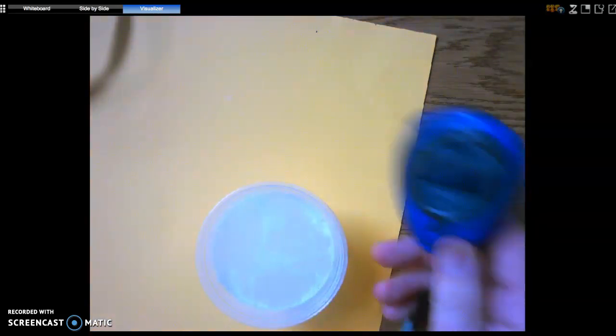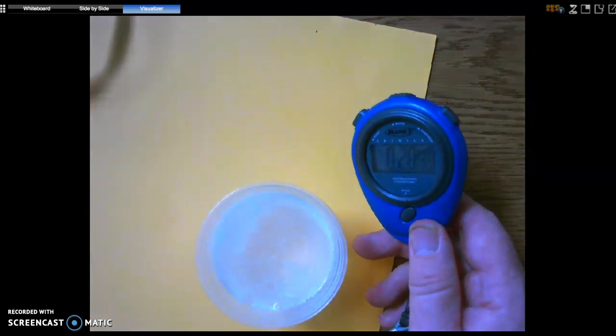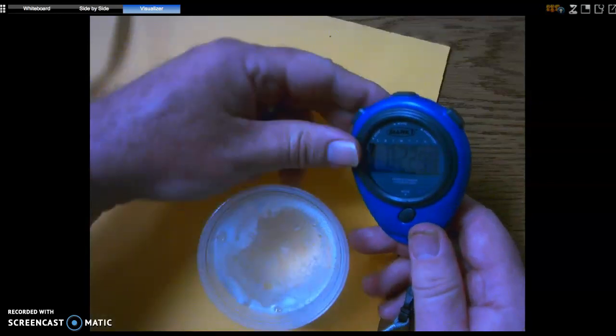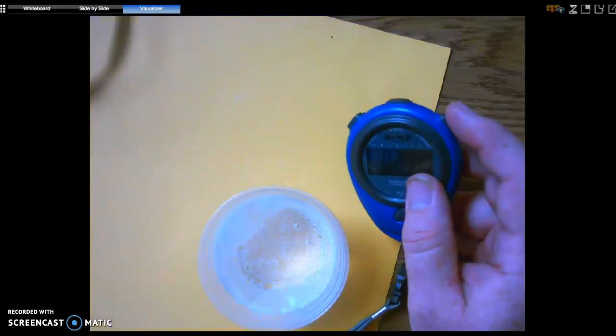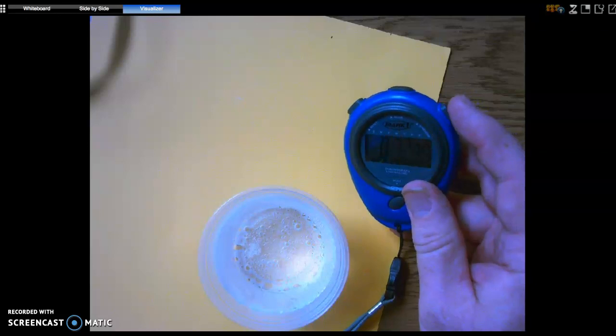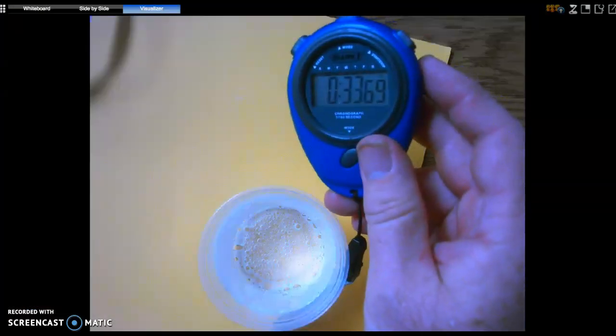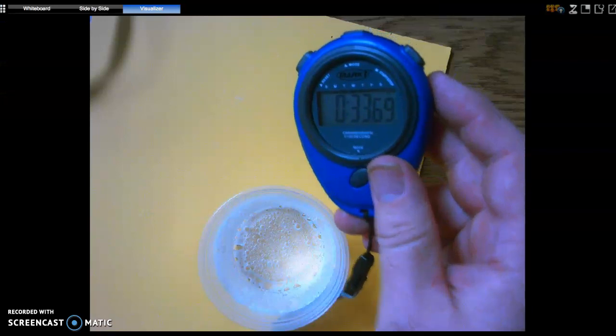Sorry, we'll find a space where you can see it. There we go. Okay, looks like there's no more bubbles, and this time we get 33.69.